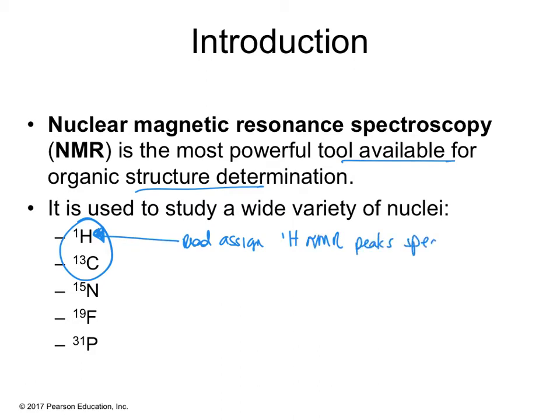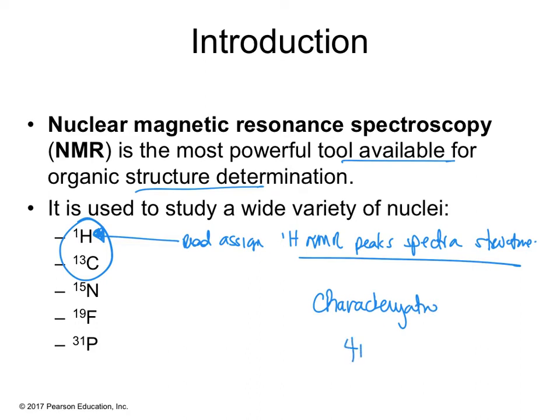spectra with structure. If you're going to study organic chemistry, then NMR is going to be a very important tool for you to determine your structure, and that's called compound characterization. There are about 4 things that NMR can teach you, and so I want you to be able to get about 4 things from a proton NMR spectra.